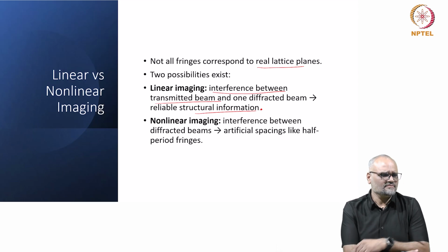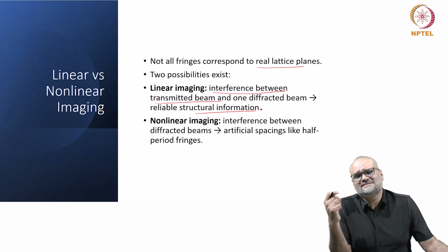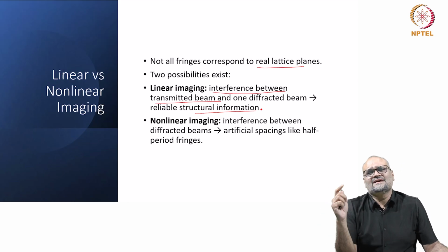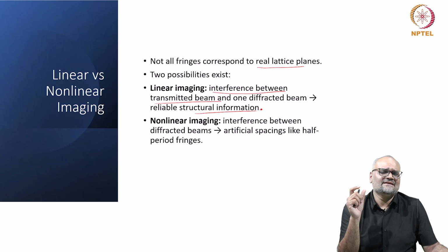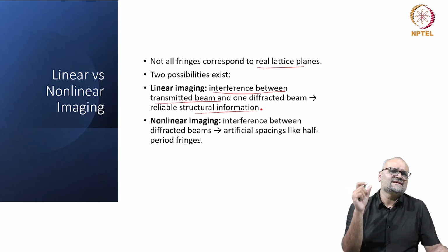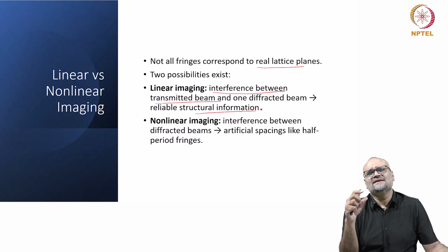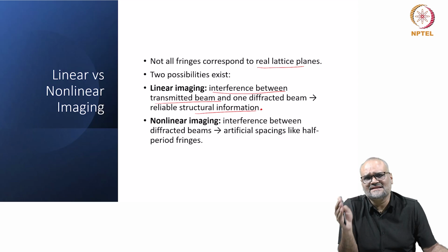So, when I was talking about changing the focus, changing the contrast, you should again recollect the idea that the objective lens, which is an electromagnetic lens, can alter the phase, and the lens also has inherently severe aberrations which also change the information that is actually propagated through the lens.